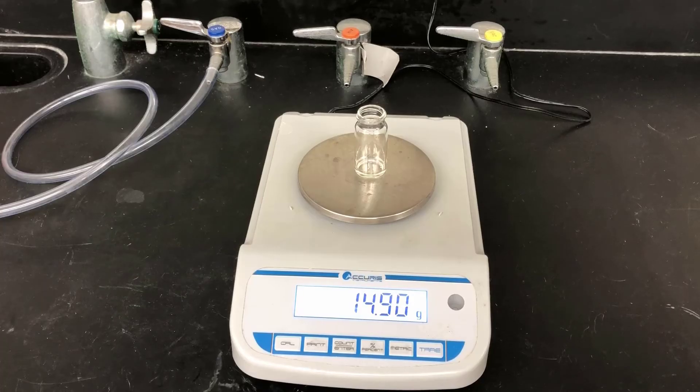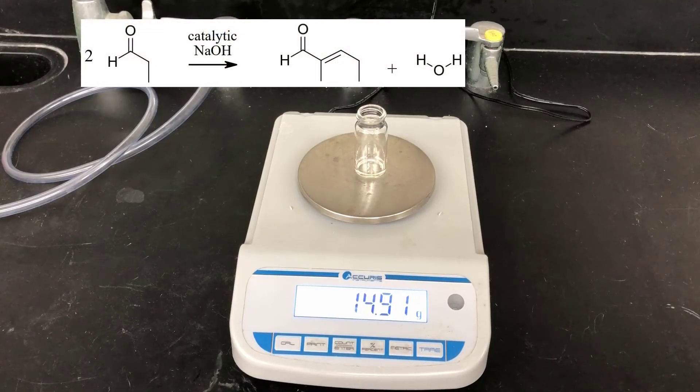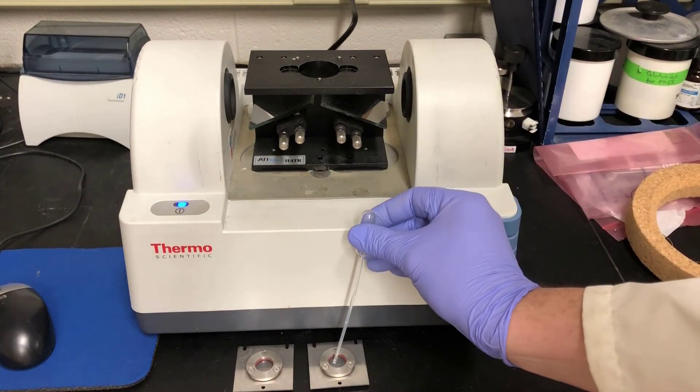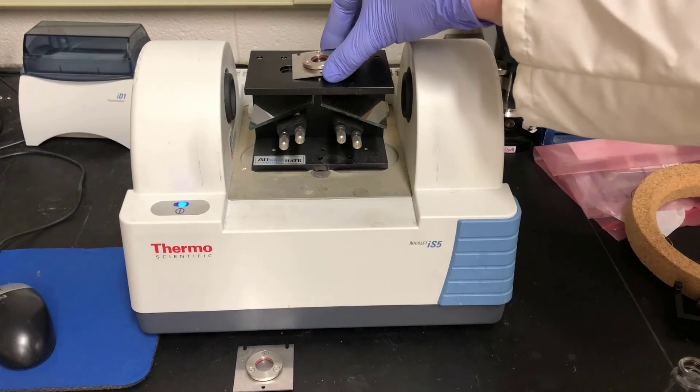When doing your yield calculations, it's important to remember that the balanced equation for this reaction is two molecules of propanal giving one molecule of 2-methyl-2-pentenal and one molecule of water — so it's a two-to-one ratio, not a simple one-to-one. Now I'll characterize the product using IR spectroscopy. I'll put a small amount of product in one of the ATR crystal wells and put that on the IR spectrometer.